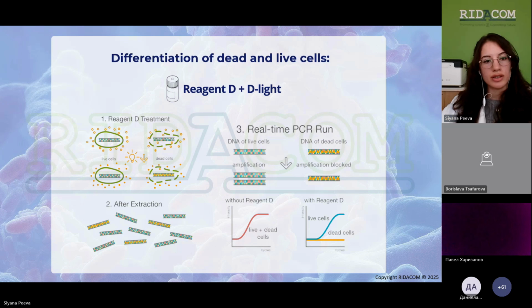When it enters the cells, it binds covalently when photoactivated through D light, and it binds to the DNA only of the dead cells because it only entered them.